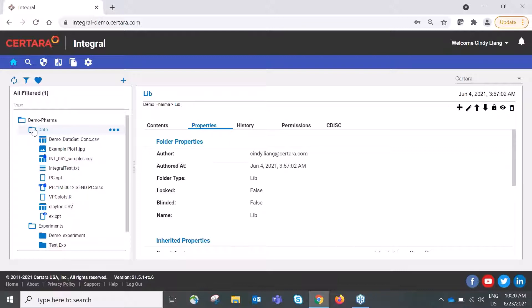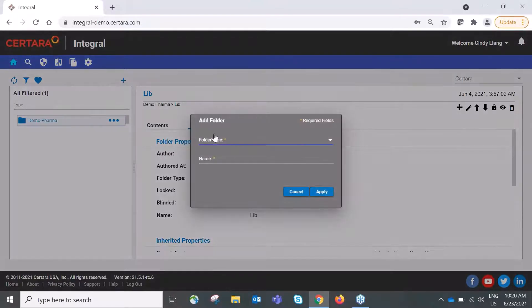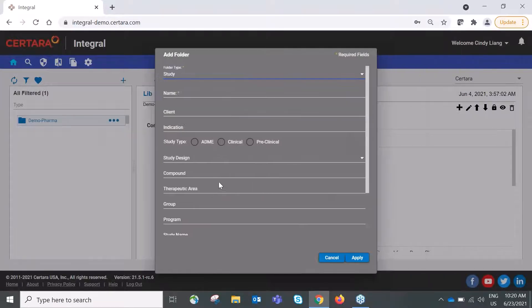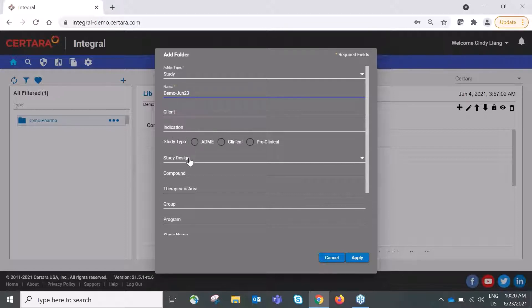To start a new workflow or study in Integral, click the plus button to add a folder. You can choose the folder type — for today's demo I'll choose Study, which is a system-configured folder type. I'll give it a name with 'demo' and today's date, and optionally fill in metadata or properties. Fields without a yellow star are not required but can be configured in the admin module.